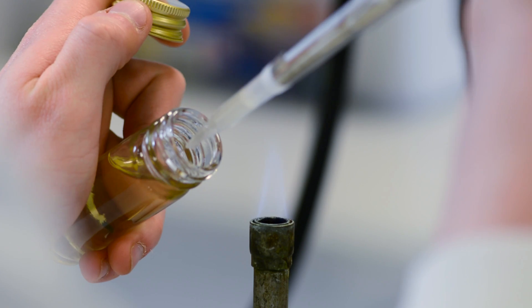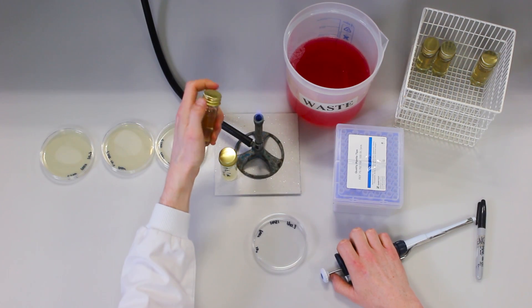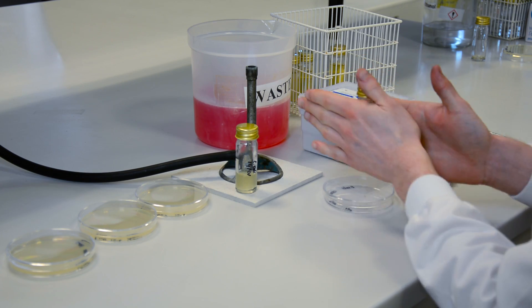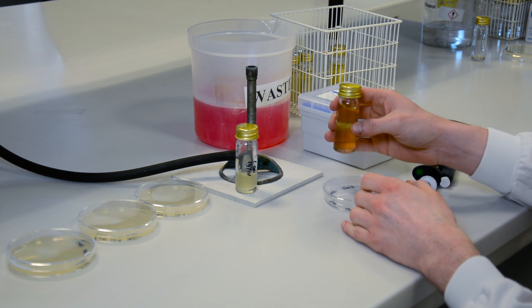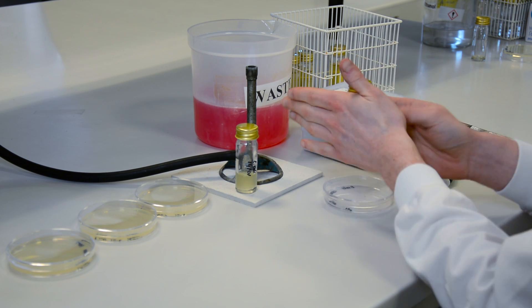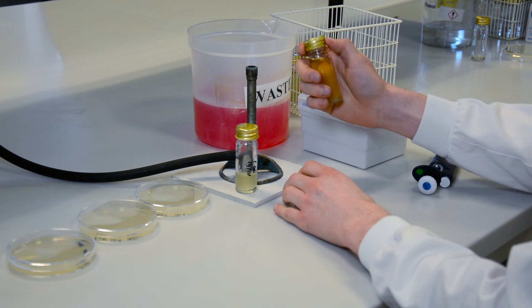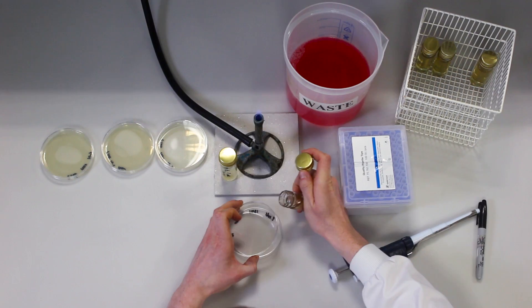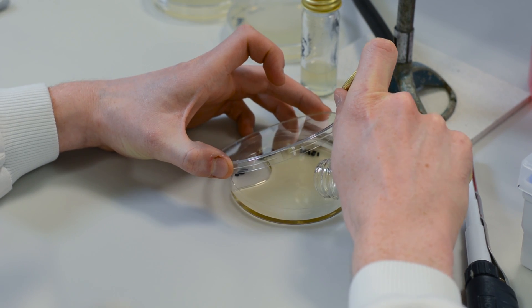The bacteria and agar are mixed gently to avoid any bubbles which would spoil the plate. The agar is then poured into a sterile Petri dish and allowed to set.